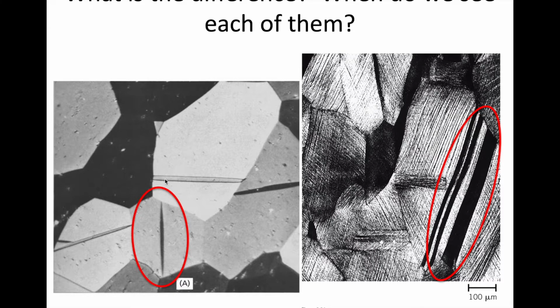So when you're looking at your micrographs, pay attention to whether it's a scratch or not based on whether it truncates at the grain boundary. All right, so that's just the last couple things I wanted to mention on annealing, because you're going to start to get these micrographs, and I want you to understand these features and where new grains come from and where they nucleate.